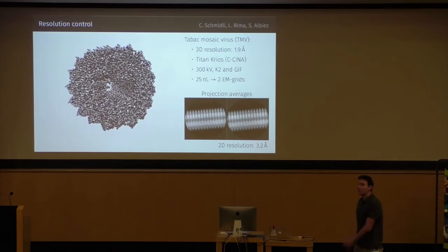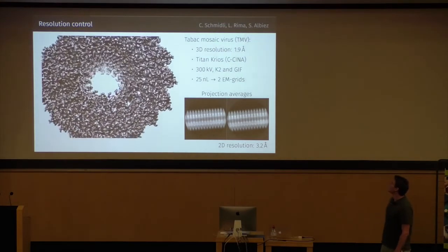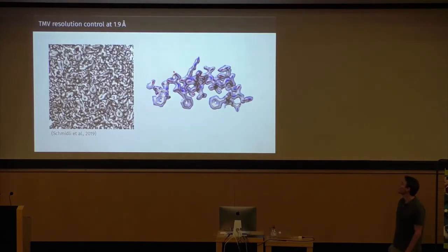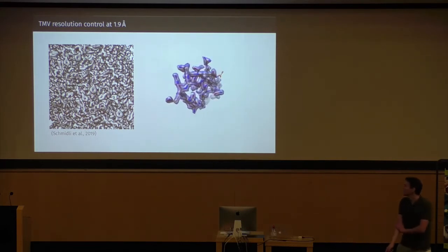The TMV, on the other hand, which was added as a resolution control, we got the final structure at 1.9 angstrom resolution, with some nice densities, even showing the holes in the aromatic rings.